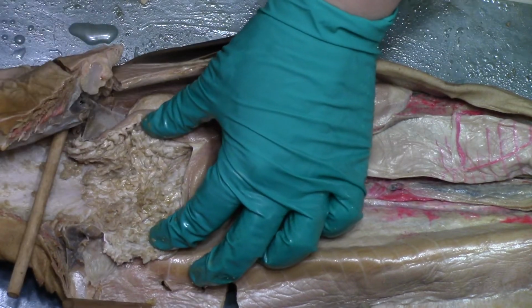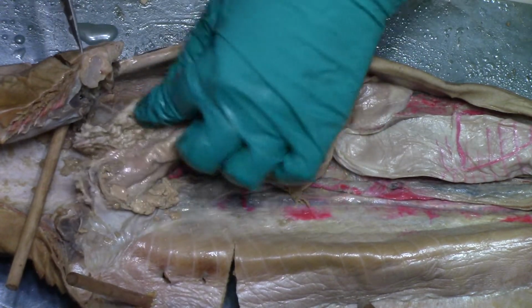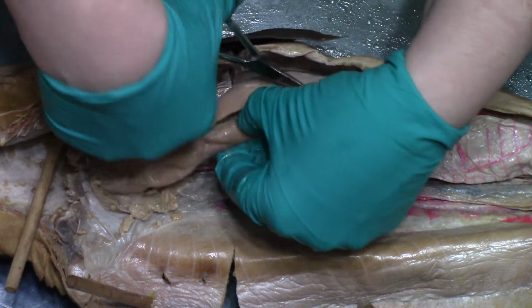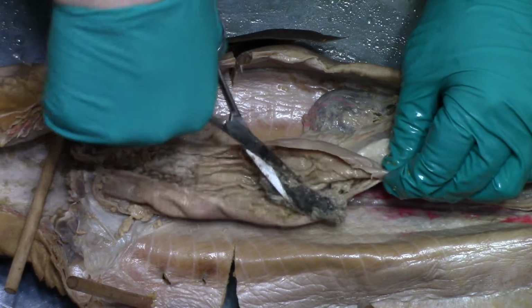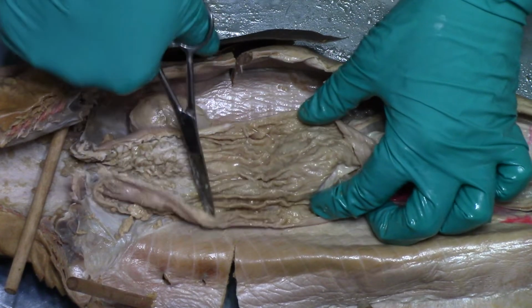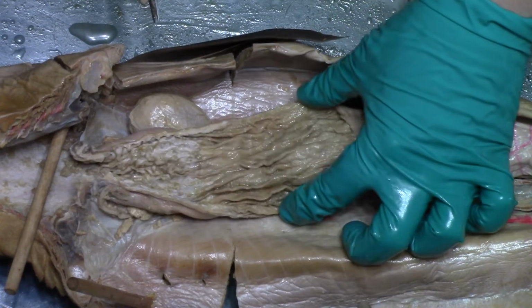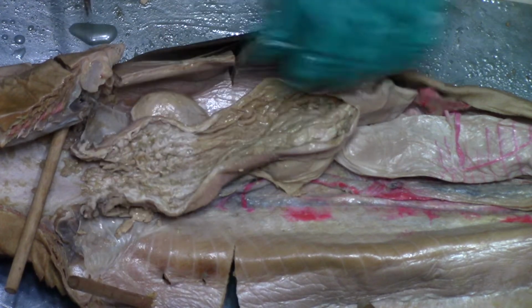See that? All these little papillae help move the food down the esophagus. And then if we get into the stomach, it's got lining. Whoa! And there's food that's half digested in here, of course. You can see those stomach ribbing. And you'll see that is pretty common in a lot of vertebrate stomachs. That ribbing in the stomach. But it is not super common to have those papillae in the throat, which is kind of neat in sharks.